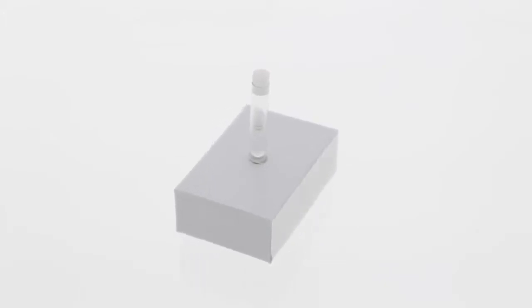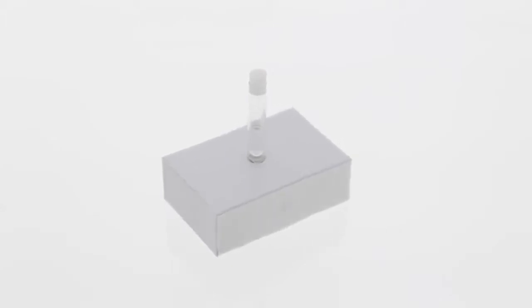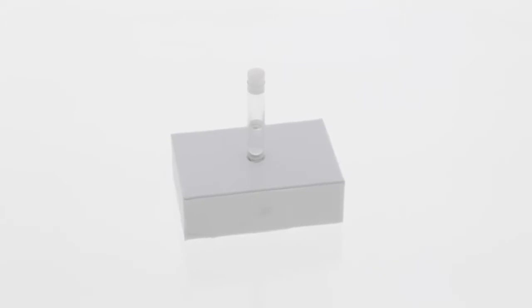These swabs are individually packaged in clean room compatible material and are lot coded for traceability and quality control.